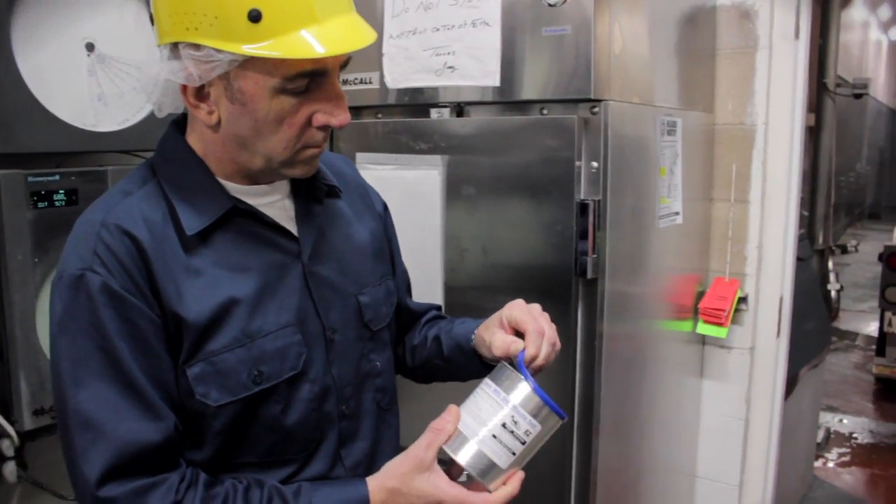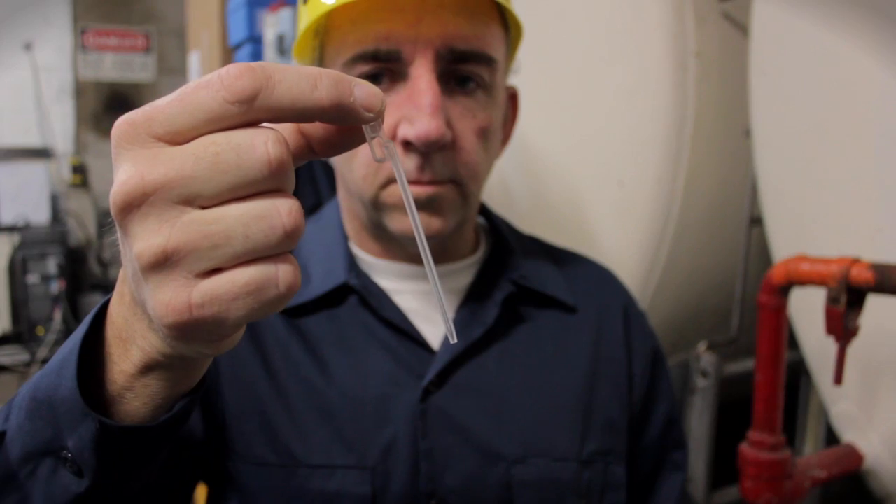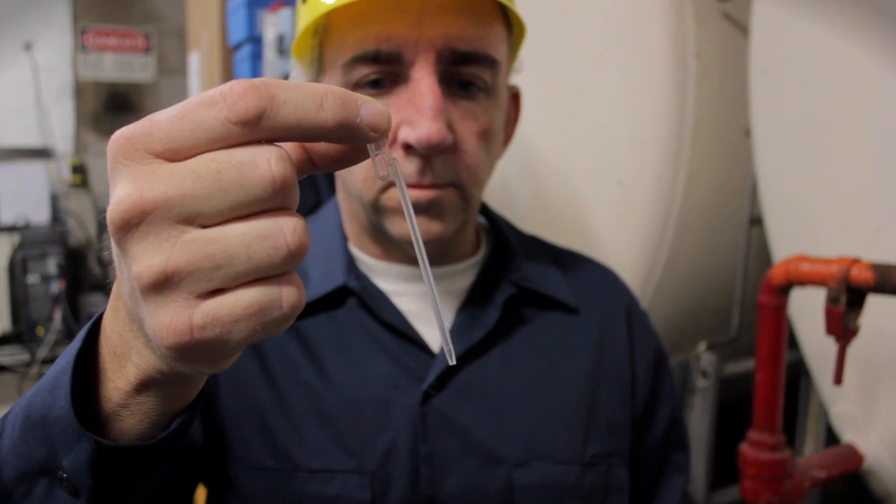All you need is a test strip taken from a can of 100 strips from the refrigerator, a 300 microliter pipette, and your milk sample.